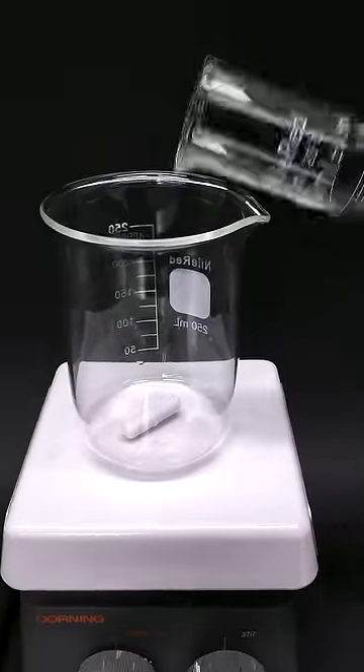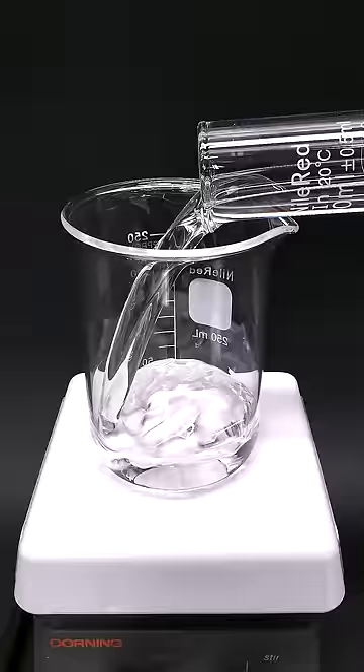So for no reason, I've decided to make some piranha solution, which is probably one of the angriest liquids that you can make in the lab.